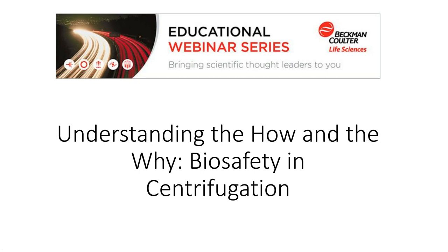All right. Next question, can I just use volume of the same solution in the same type of tube to balance instead of weight? So I'm going to say no. For a microcentrifuge, a tabletop microcentrifuge, sure, balancing by eye is probably good enough. Once you get to something that's going to generate more force, please balance by weight. I know some people who work with things like deuterium, and balancing by eye, if you've got water and something with heavy isotopes in it, that's not going to work.